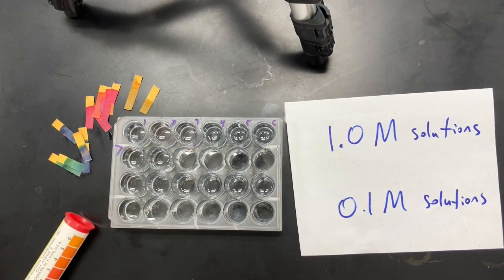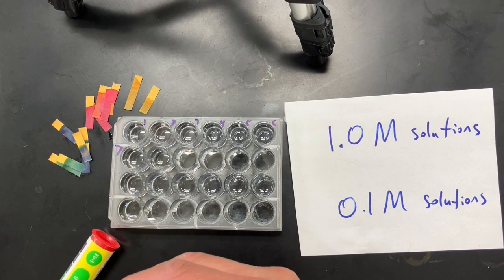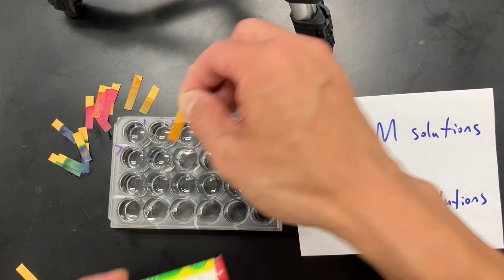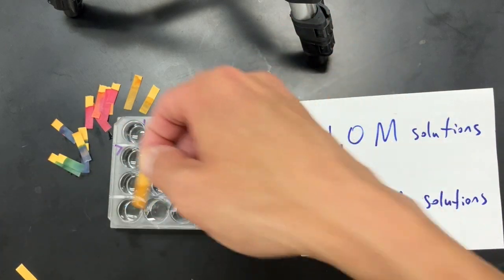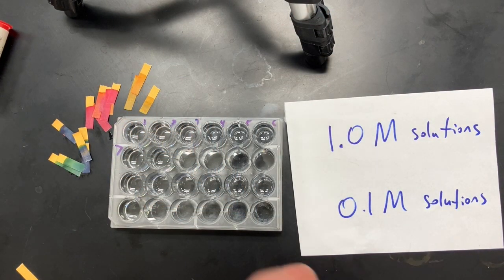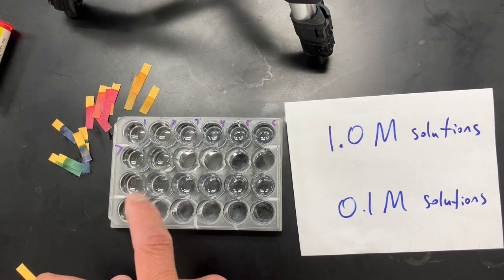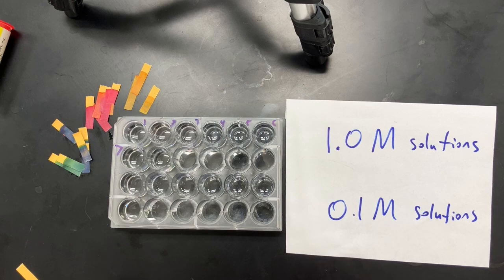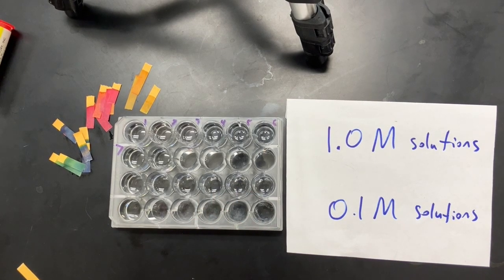So salt water, neutral, and then water, you can't have different concentrations of water. So water is just this one right here. Nothing happened, okay? So for a couple of them, we'll look at something called a pH meter or pH probe. We'll see if we can tell any differences between a couple of these solutions. So I'll set that up now.